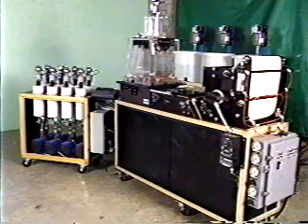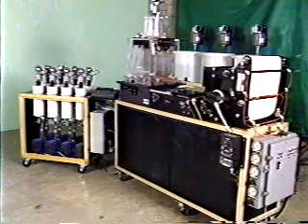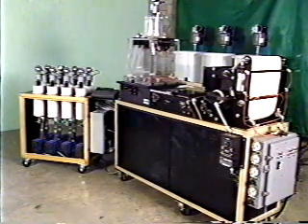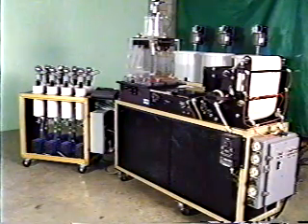The MK Systems automated sheet former simulates every aspect of the paper making process in the lab. It is the most complete instrument of its kind available.